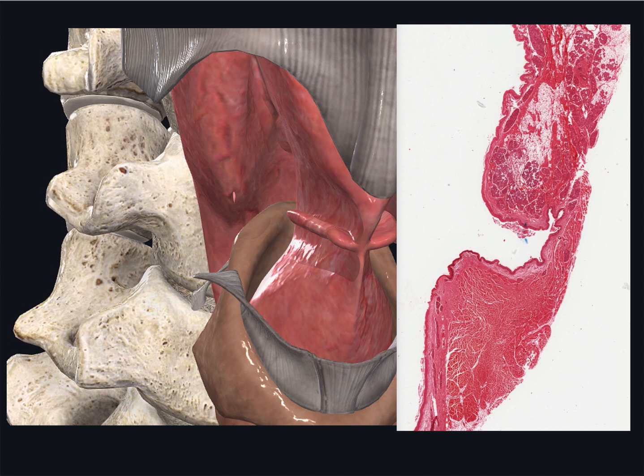The orientation of this section can be a bit confusing. It's a coronal section through the wall of the larynx only on one side. The lumen of the larynx would be at the left of the section. The ventricular fold or false vocal cord is cut transversely here above the ventricle. The true vocal cord is cut transversely and is here below the ventricle.